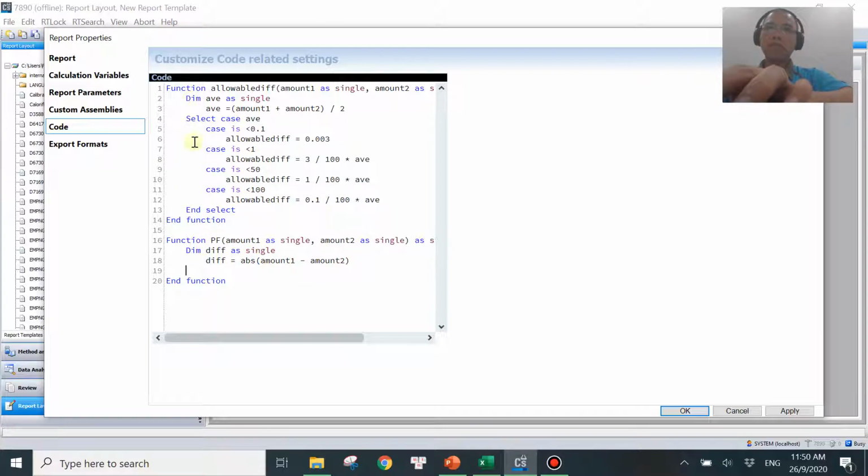And you don't want to rewrite everything like this again. So in order to reuse the function on top here, you want to add another keyword on top here called public, so that you can reuse this function down here without retyping everything. Okay, so what happened is we can add an if function right now.